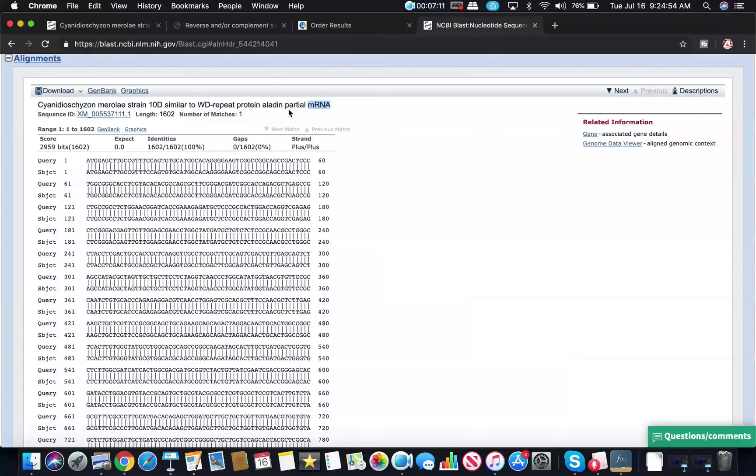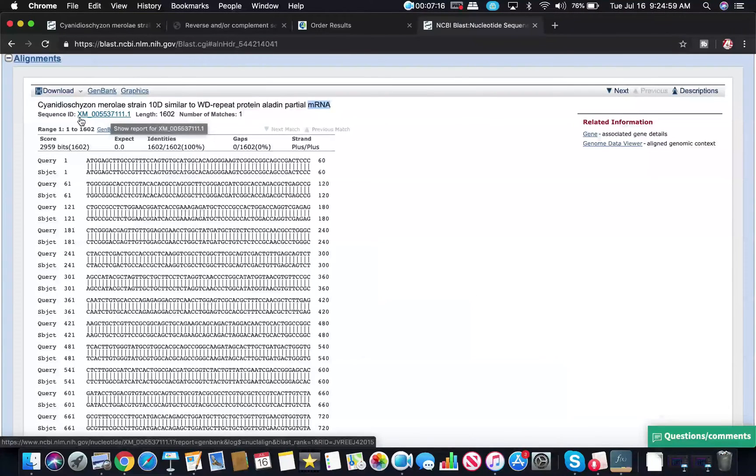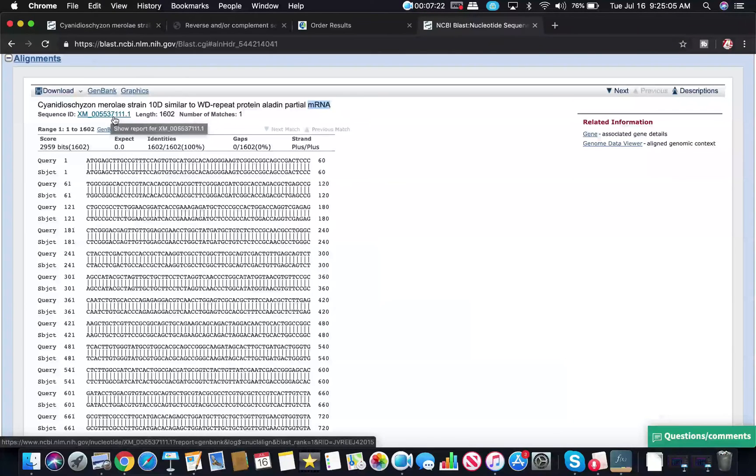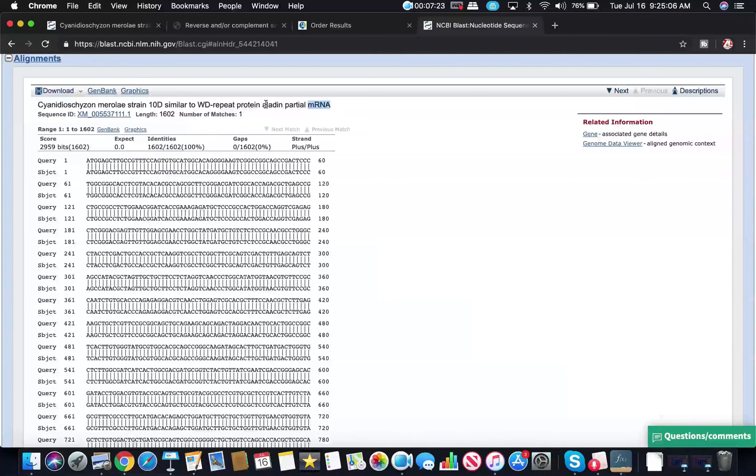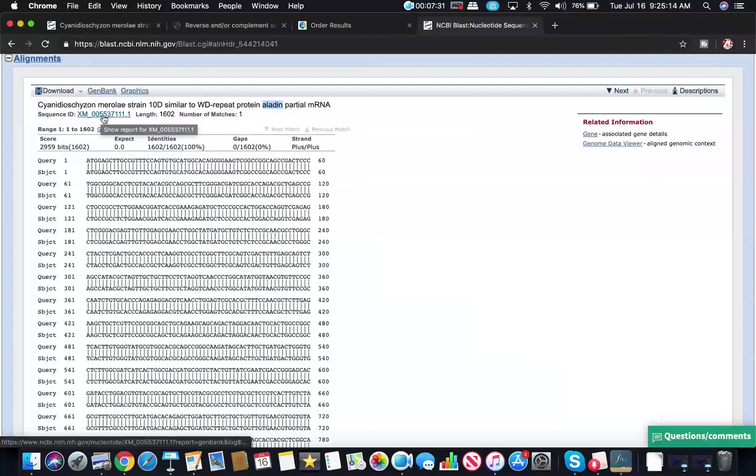One other thing that's very important is this XM number. I brought this up in one of the previous videos that this is a very important sequence identifier. In some less commonly studied species, they may not have the same name protein or it may not even be named at all in any reasonable way. But if you know the XM number of the sequence that you're looking for, you can match it up.